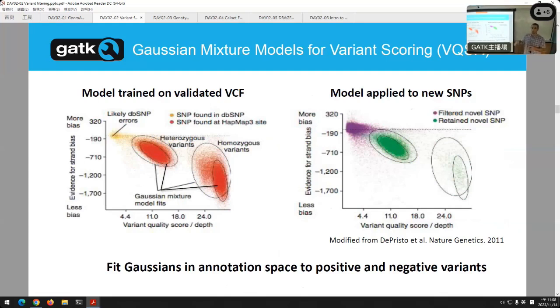And also, if it showed up in something called dbSNP. dbSNP was also a catalog of SNPs and indels in the US, supported by the National Institutes of Health, that is less reliable because it wasn't the government creating call sets. It was PIs and researchers contributing their variant calls. And this was in the early days when they didn't use the GATK.